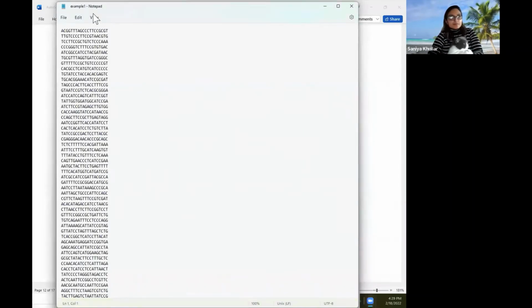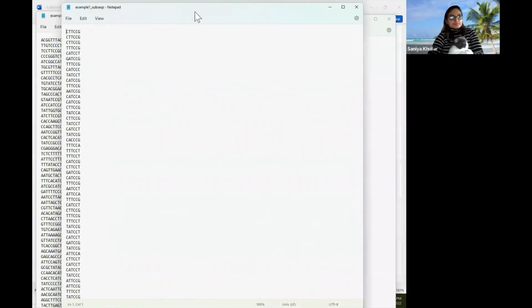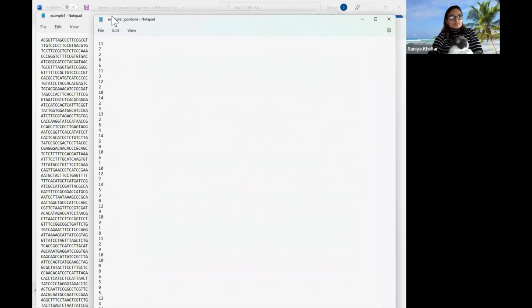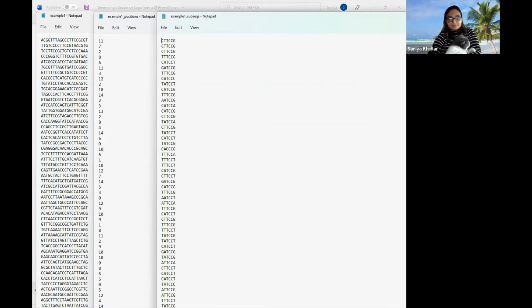We have our example 1 here. What I want to do is just focus on this, for instance. Because this is 2, it is a little bit easier to count. Let me make this red, so it is easier to see.